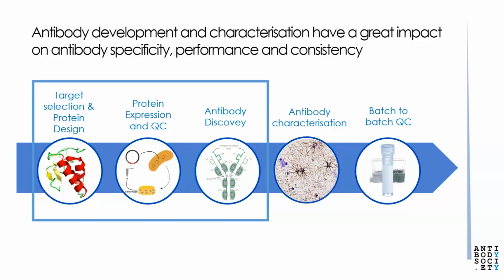So generating high quality antibodies requires effective strategies for immunogen design, protein expression, antibody discovery and manufacturing, as well as specificity validation and strict batch testing. The choice of the antibody format combined with high standards in manufacturing has a great impact on the specificity, antibody performance, and consistency.